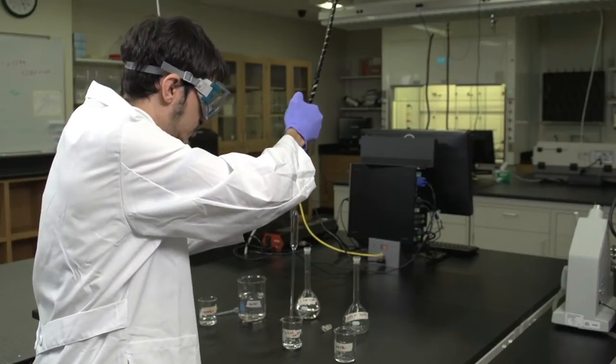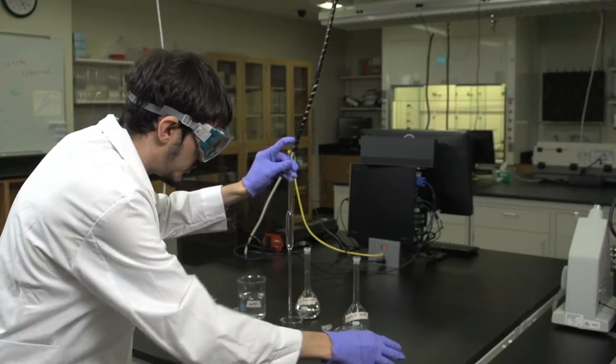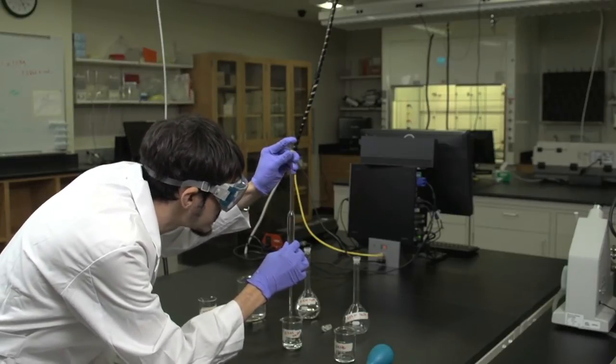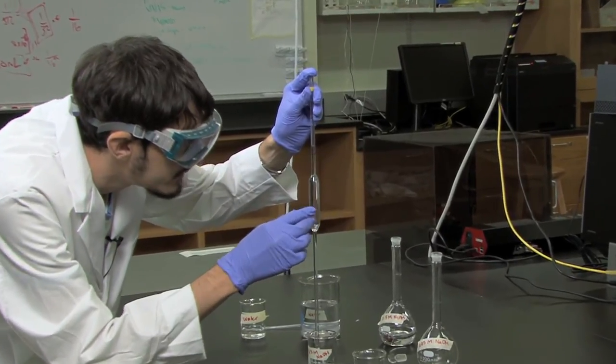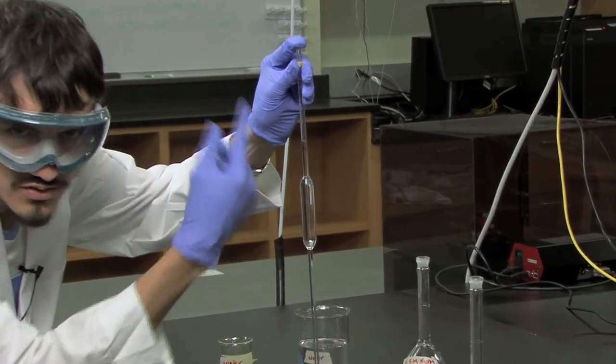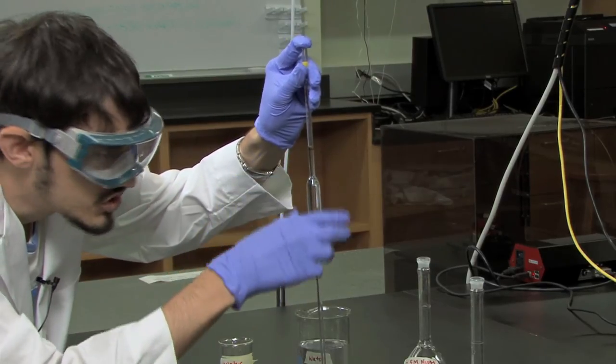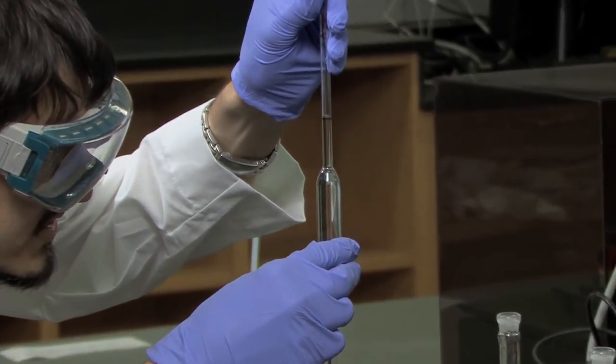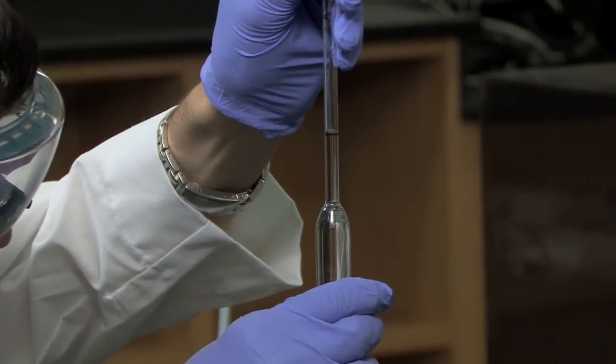Once the solution is above the mark, put down the bulb and place your finger above the mark, and ever so slightly remove your finger to allow atmospheric pressure to return to the system. The level of the solution will drop, and you want to make sure that the meniscus rests just upon the line.